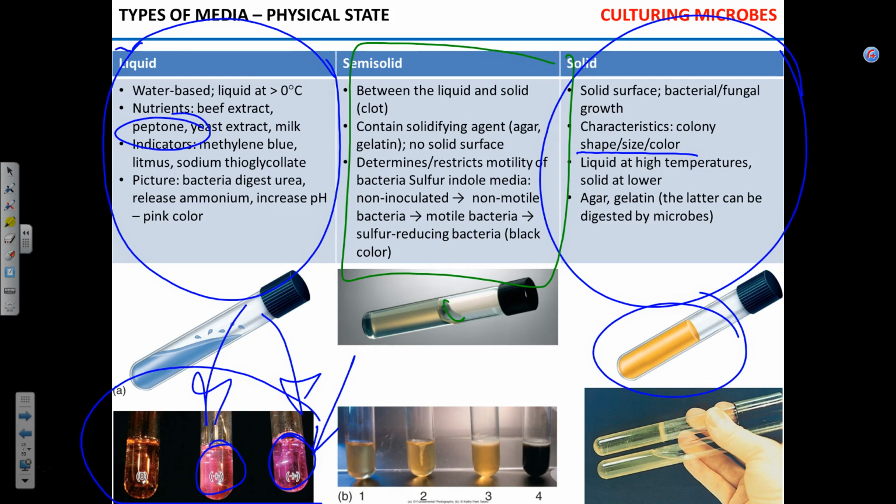I bet somebody stole it from me. Yeah, somebody stole it from here. But if you take the immersion oil, it is viscous, but it's fluid. The only problem is that only I can see how it's about to spill out of the bottle. Okay, this one will not. I mean, I can turn it over. Nothing's going to happen in at least the first 3, 4, 5 minutes.